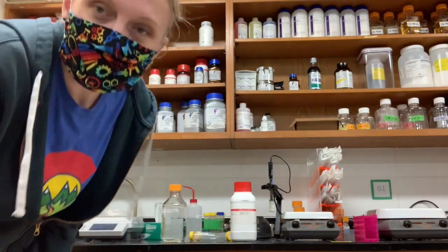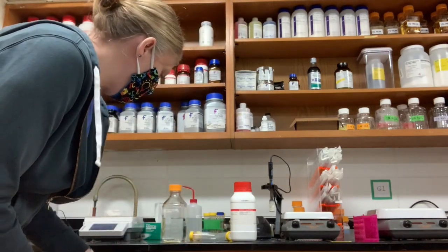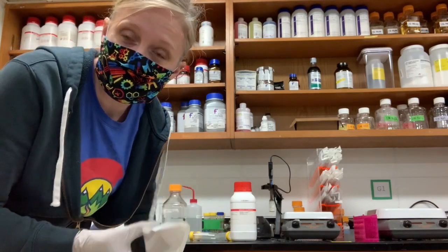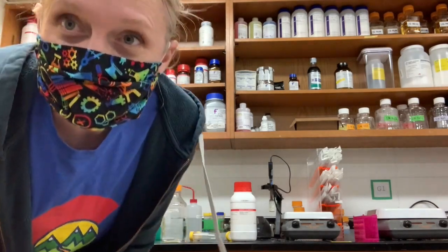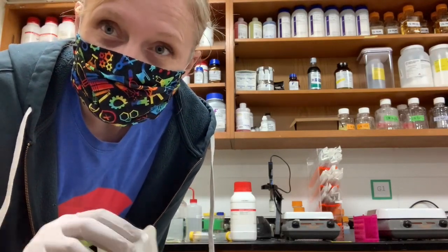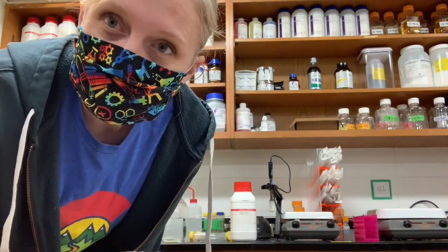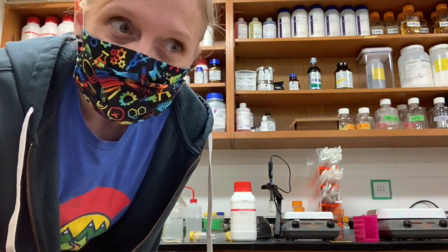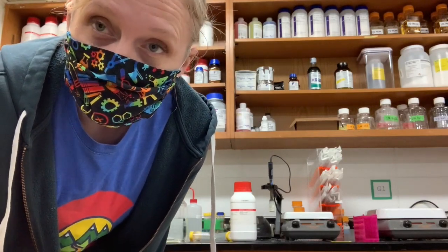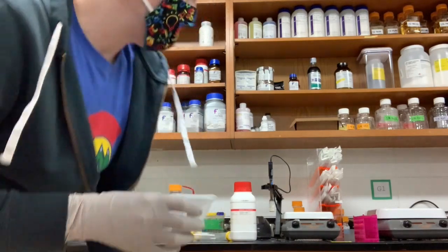So sometimes you'll pour out just a little more than you mean to, and what you can do is take another weigh boat and just scoop out the extra and throw it in the trash. You don't want to take chemicals out of the bottle and then put them back in. There are also some spatulas over by the sink in the glassware cabinet, so if you prefer to use a spatula, you can do that. Just make sure you only use it once and then make sure that it's cleaned between uses. You don't want to contaminate chemicals with residue from other chemicals.